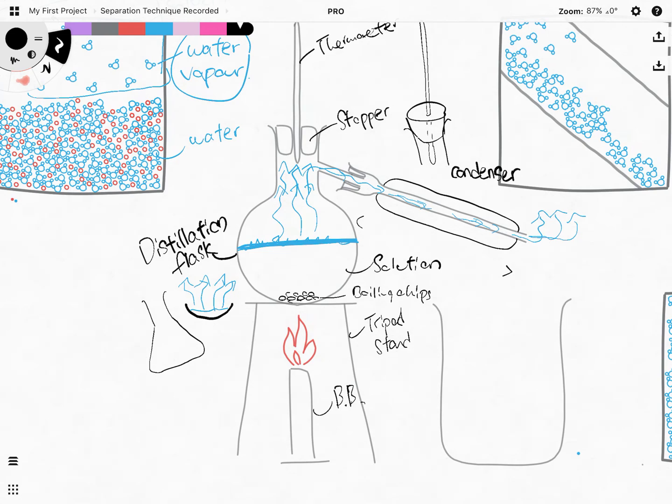So how do I fill it up with cold water? Actually, I'm going to put another tube coming out here. Okay, so I'm going to supply through this tube. Let's go in cold water. So in a sense, I've included a smaller tube onto the bigger tube. Right, cold water is going in and then it's filling up the cavity of the big tube.